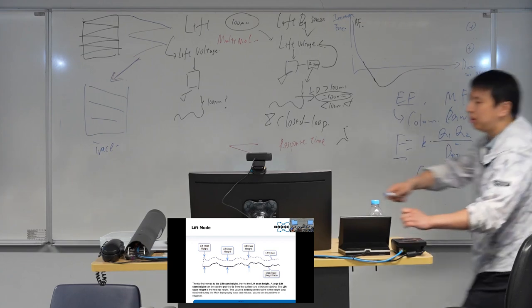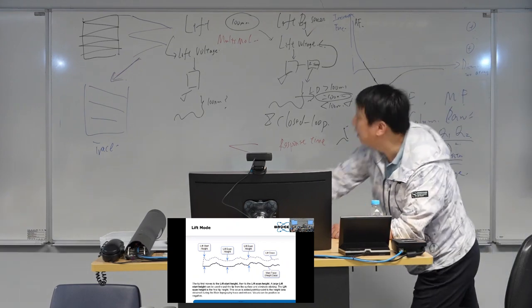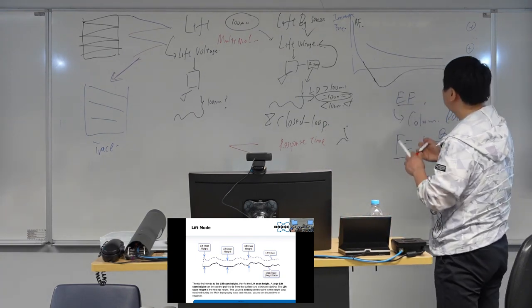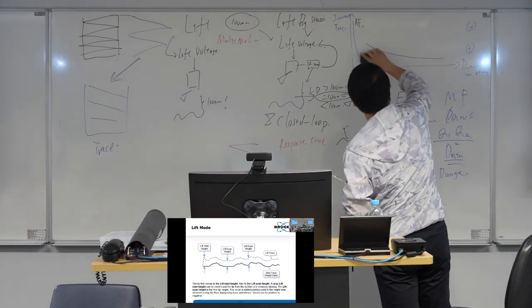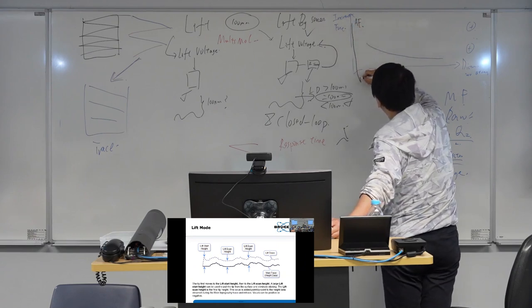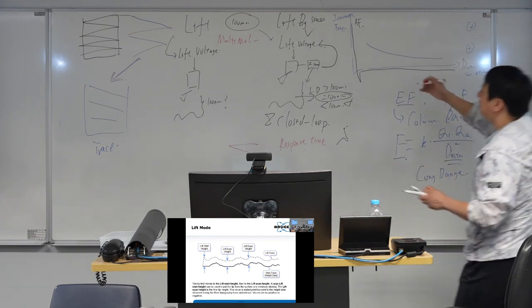So if we place this force in this interaction force distance loop, it's long range. Sorry, I made it more dramatic. So the AFM, the AF, will be something like that. It's quite short range, but the electric field is long range.